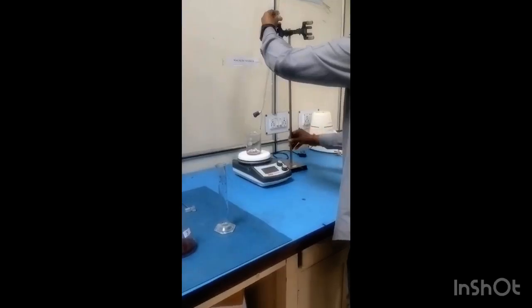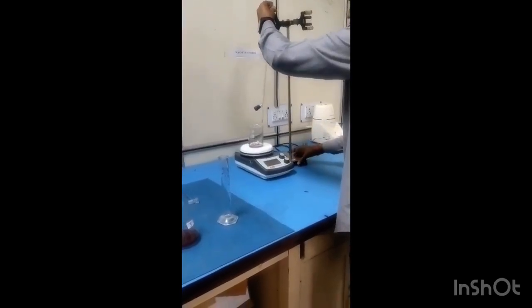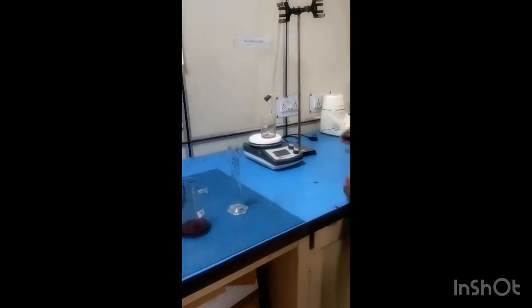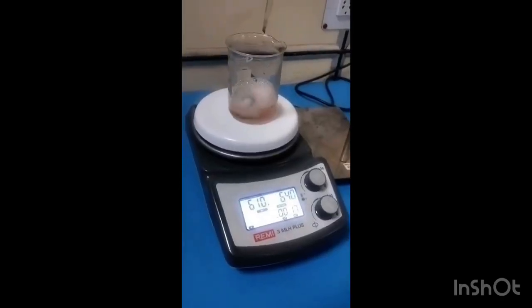After 30 minutes, close the stirrer and check whether a layer is formed, separating the solution in the beaker into 2 zones. Place the solution in a test tube, close it with the lid and label it. Then observe after some days whether nanoparticles are formed or not.